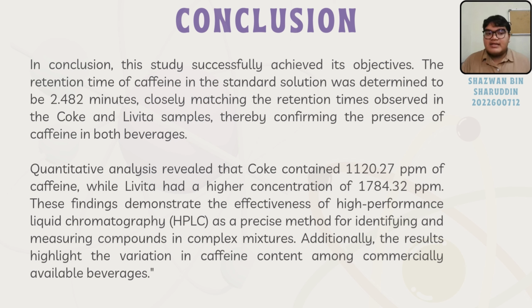We trust that this study not only highlights the capability of HPLC as a reliable analytical tool, but also provides valuable insight into the caffeine content of commercially available beverages.